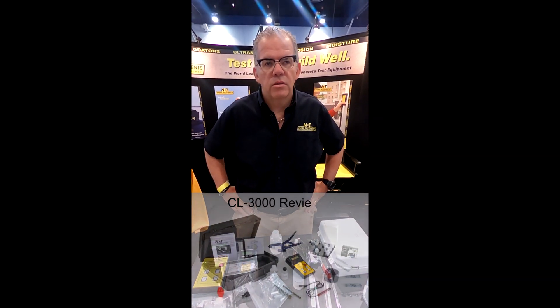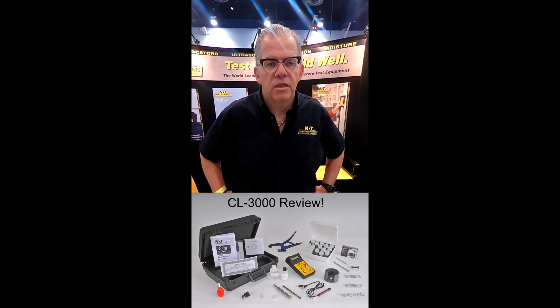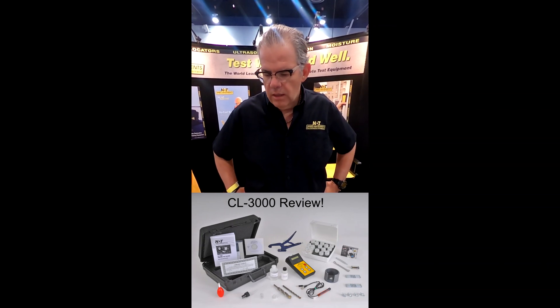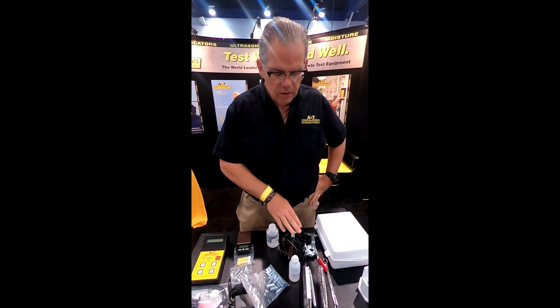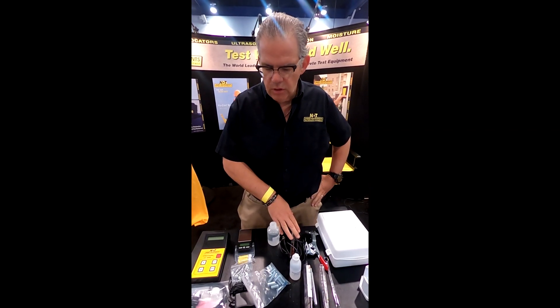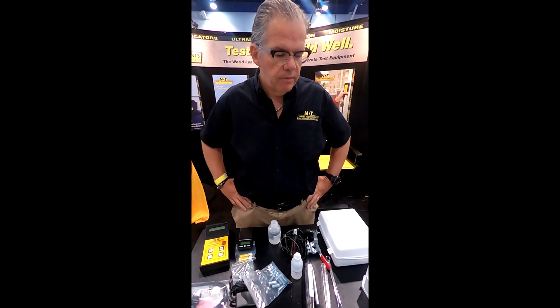How are you doing? Today I'd like to review the Chlorimeter CL3000 Rapid Field Analysis Kit for Chloride. Basically the idea is that we use a chloride ion-selective electrode and the handy-dandy meter that goes with it to rapidly test the amount of chloride in a 3-gram sample.